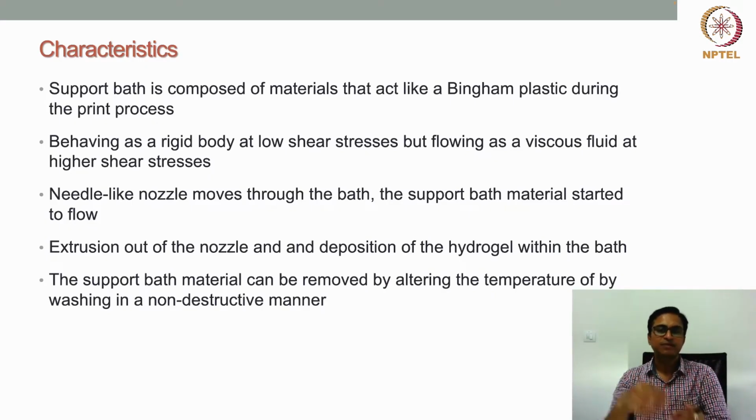Suppose the material is just kept as such; then the material will not flow. There will be no flow. The material will behave almost like a solid if no force, or very little force or stress, is applied. But that same material will start to flow when the applied shear stress reaches a certain level. That means at a very low shear rate, the material will not flow. But if I increase the shear rate, shear stress or force, then the material will start flowing. That is what a Bingham plastic is like.